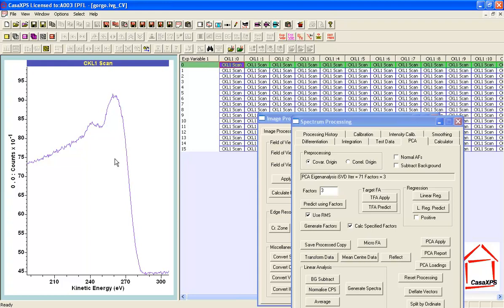So these data are now in a form where the analysis can proceed: peak fitting and then differentiating based on the peak fits, but that whole process is being supported by the fact that we've been able to use the information in this data file to remove a significant proportion of the random noise within these data. When we've calculated the noise reduced form of the spectra, one way to investigate how well that operation was performed is to display the residual.